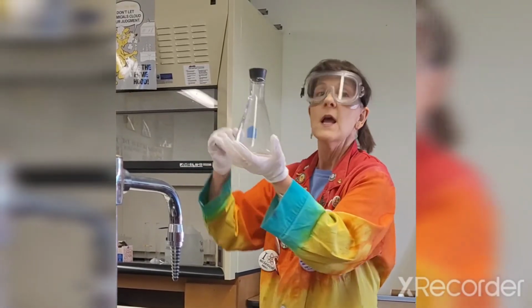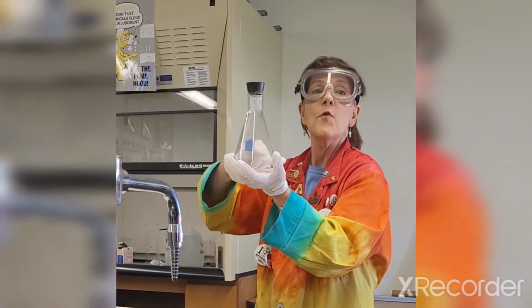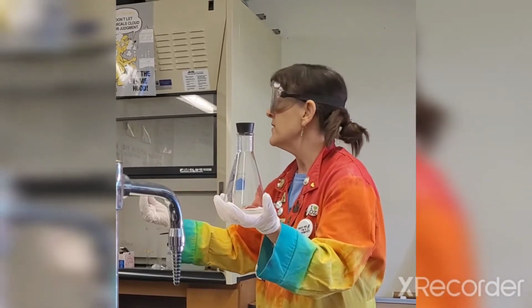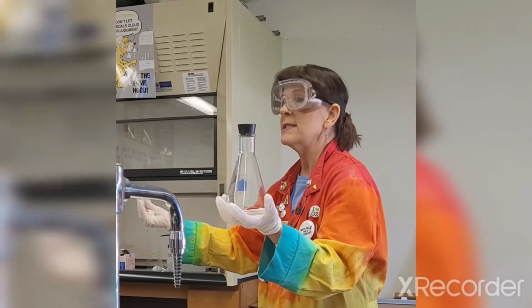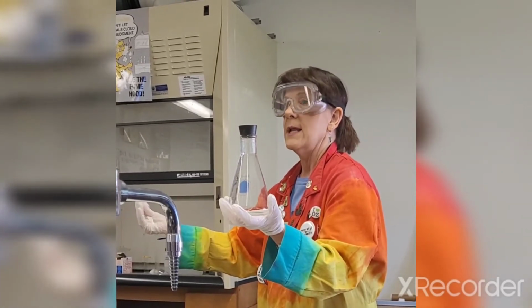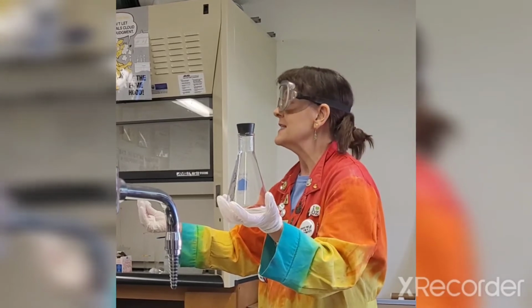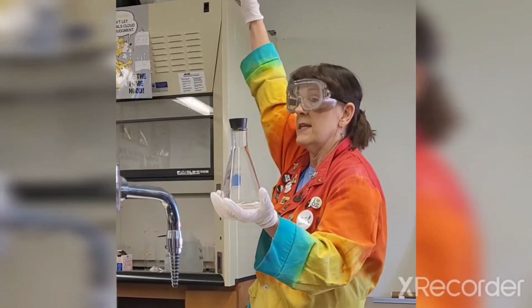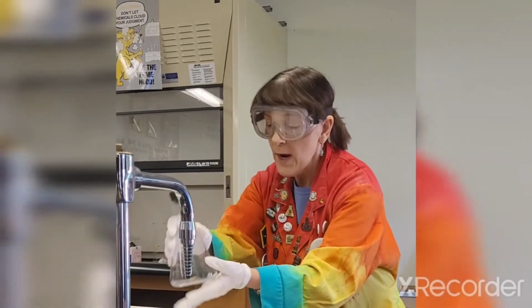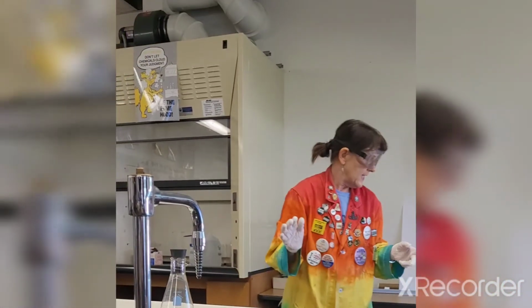You can't see it. But y'all, the gas that we are forming right here is dense. What does that mean? Y'all done density stuff before in science. What does that mean? If something is dense. Anybody? Where does dense gas go? Does it float up to the top? It goes down. It goes to the bottom. It goes to the ground. So what I'm about to do is give it a chance to do that.